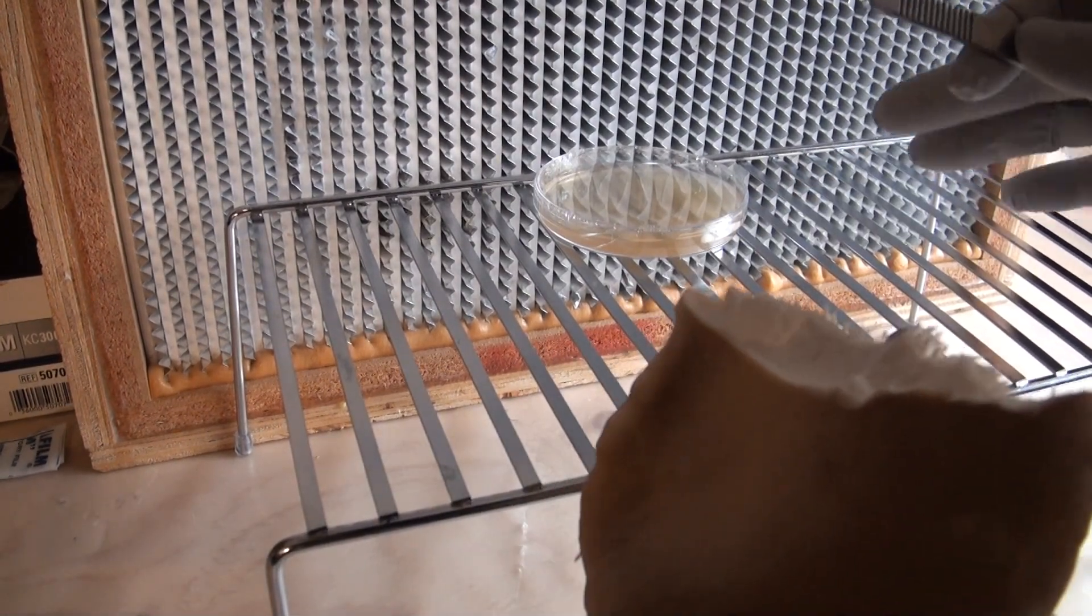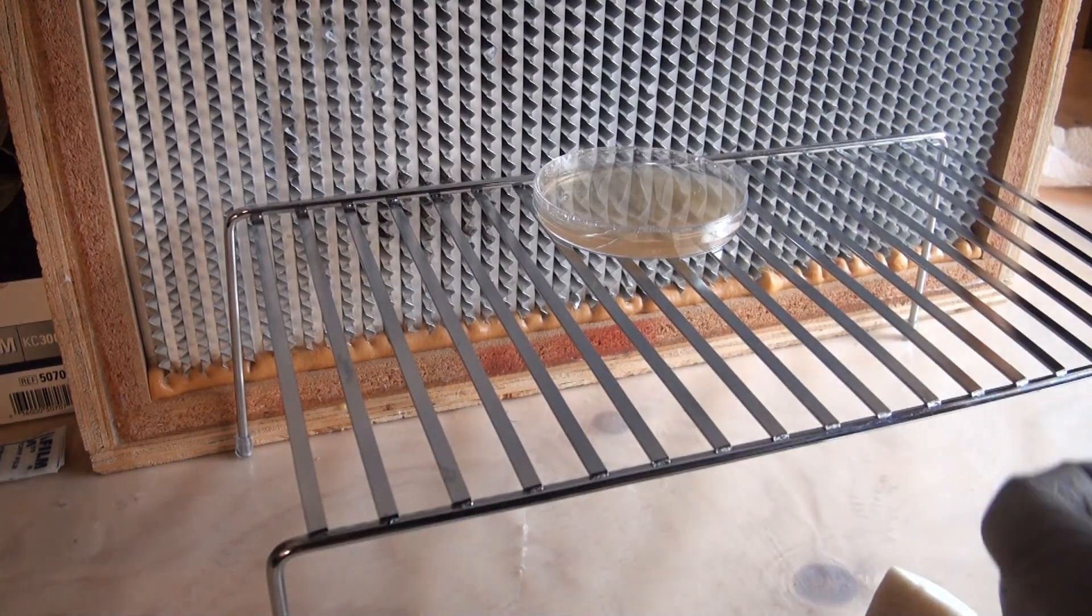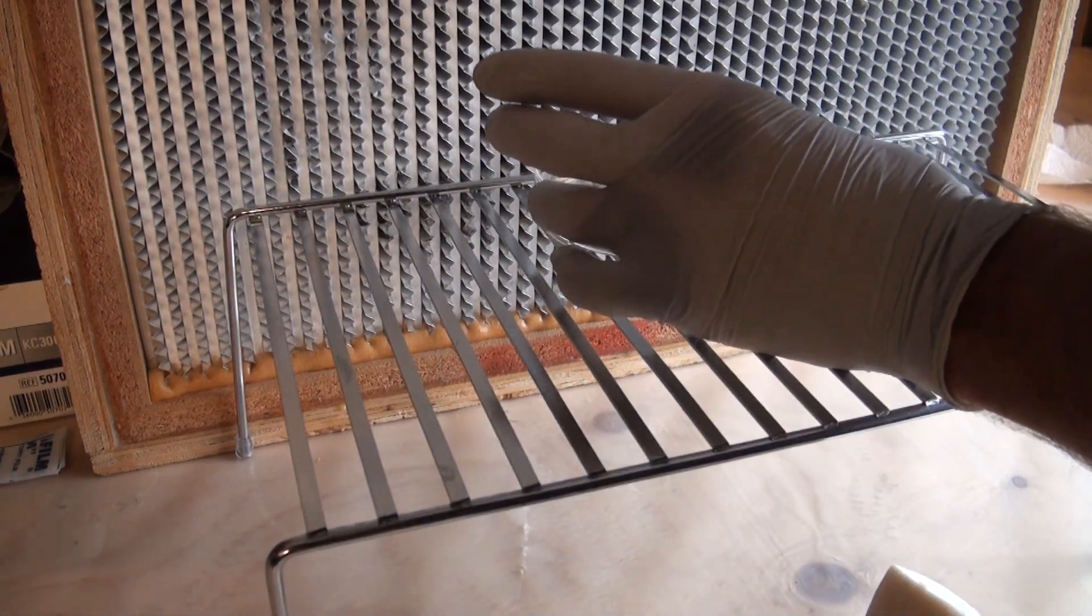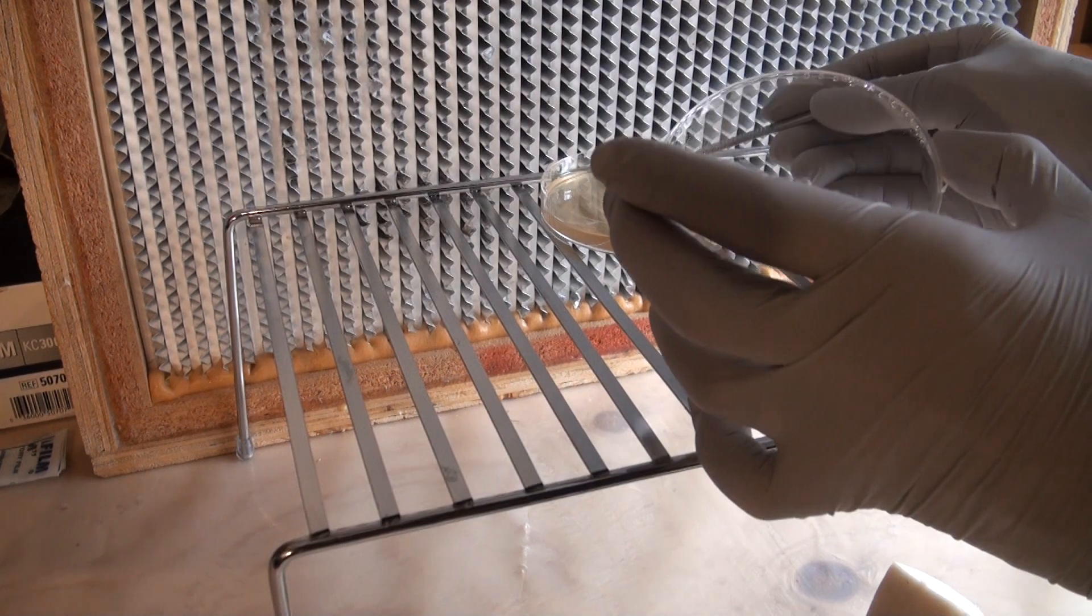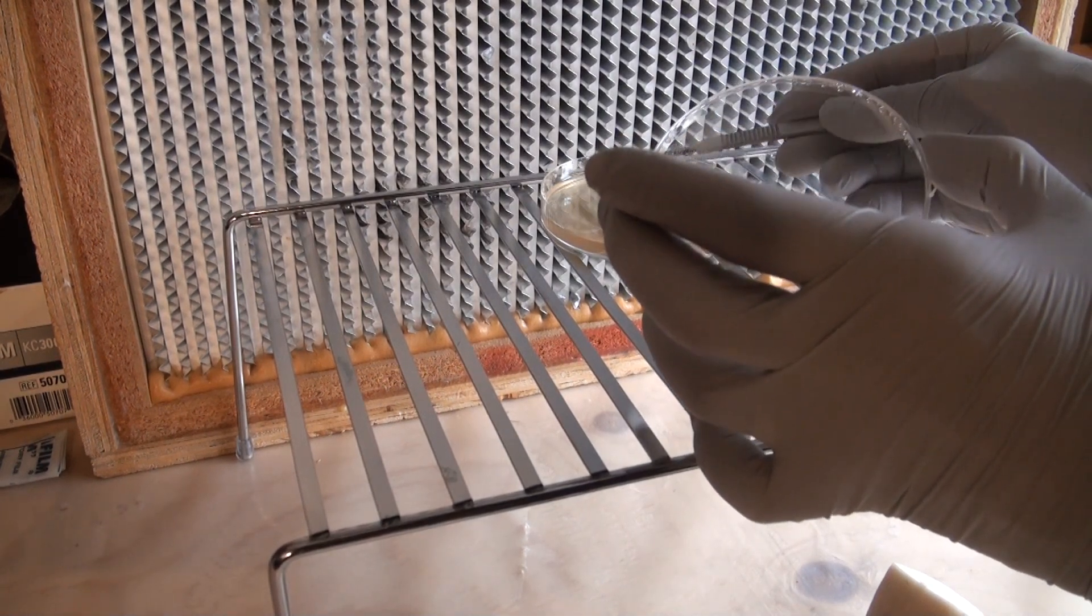Now you want to make sure you keep the dirtiest things downstream and the cleanest things upstream. So I got the mushroom fruit body downstream and the agar dish upstream. I'm going to go ahead and scrape some of this tissue out from inside of the mushroom and go ahead and place it on the dish.